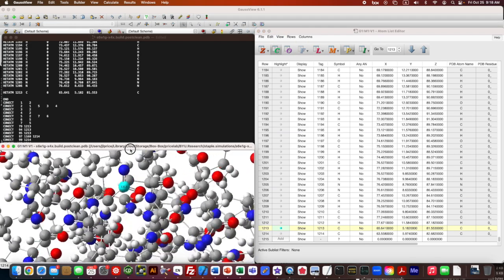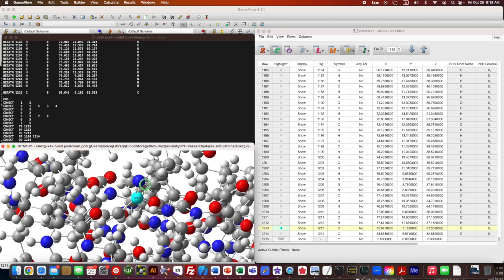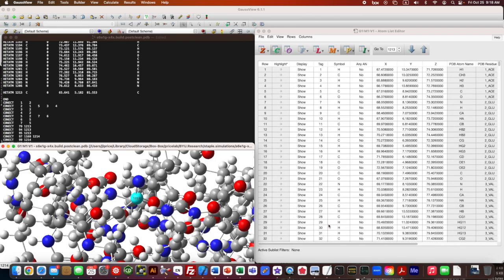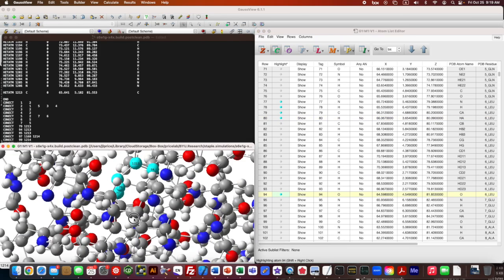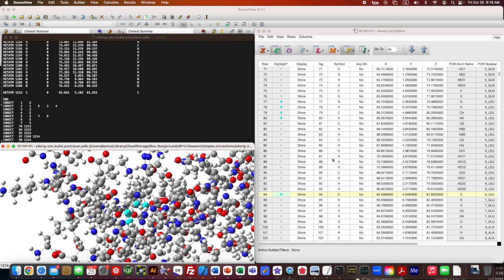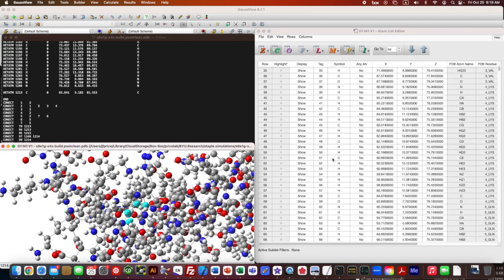Oh, where are you? That was helpful. That was not centered. And our hypothesis is that it goes to, I think, leucine 6, because leucine 6 looked like it was missing a carbonyl carbon. I see nitrogen, alpha carbon, and I see an oxygen. And indeed, that's right. 1213 is the carbonyl carbon. Whoops, I lost it, but that's okay. I didn't need it there anyway.